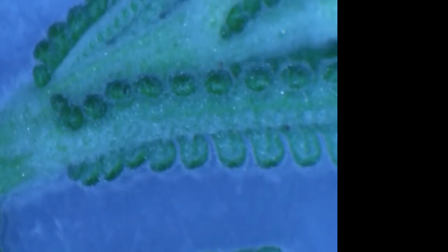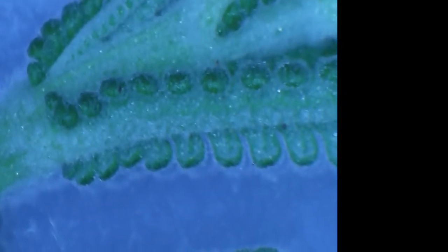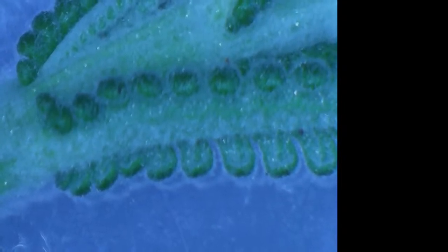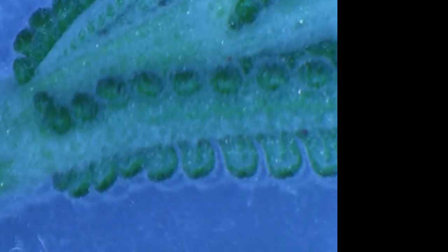And we're going to look at some lavender. It has these interesting leaves. Very furry, and being one of these kind of plants, it's very glandular. You get the very aromatic smell coming off of it. You can see the little glistening areas that are almost like sticky. That's where the scent emits from those little guys.